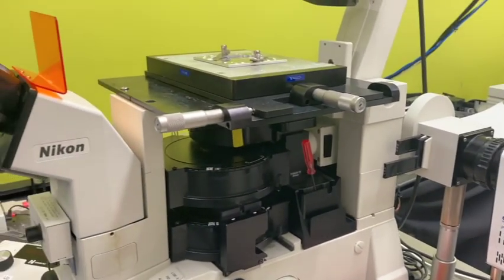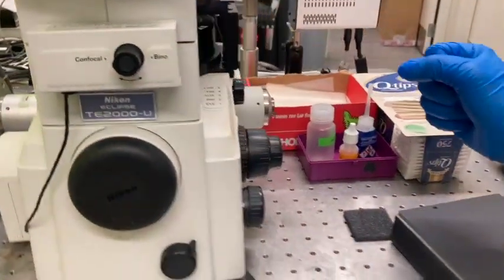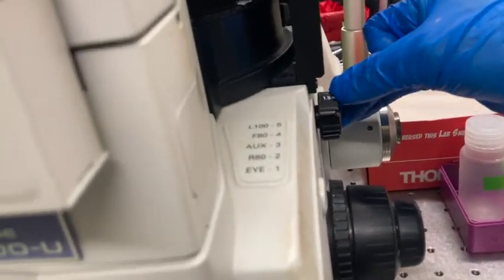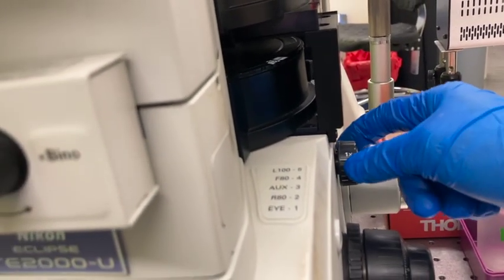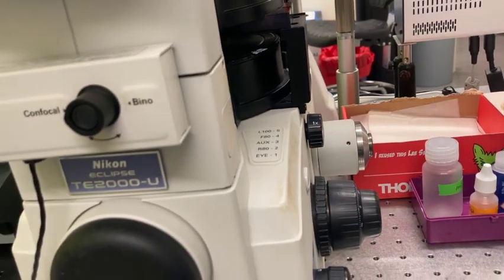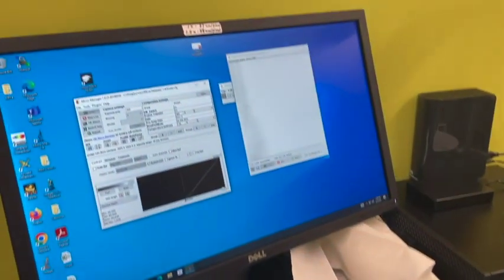So now if we look at the movie here, find the surface, and that's a trick to find the surface. Very good one. I'm proud of it. So we have a 1.5x here, and also a 1x magnification. So this 1x and 1.5x is an additional magnification added to this system. 1x is smaller, 1.5x bigger. So with 1x you can see here the field of view. It's our exposure.